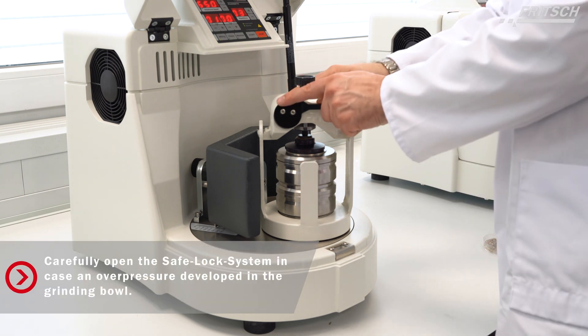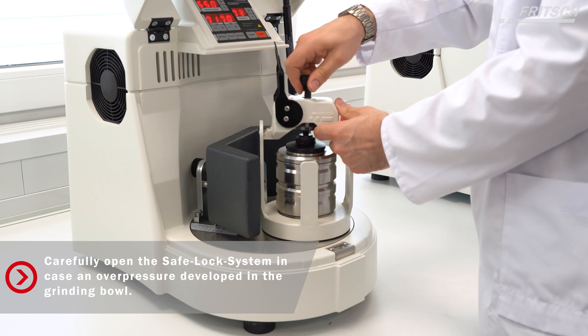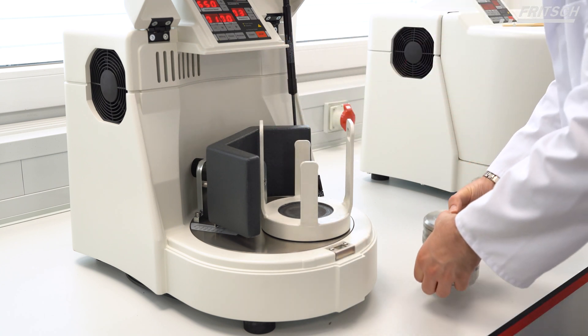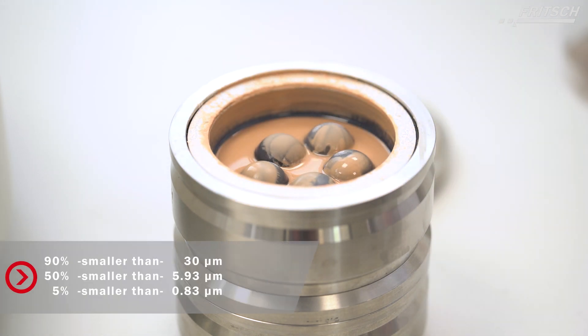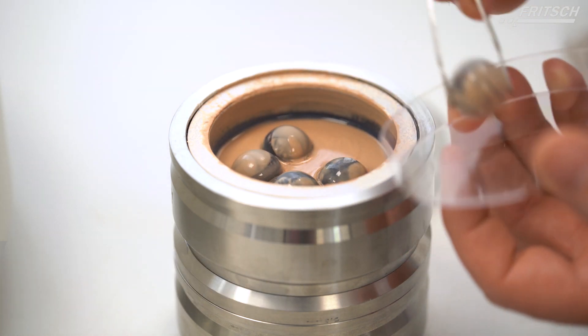Now carefully open the safe lock system in case an overpressure developed in the grinding bowl. We measure the particle size of the sample with the Fritsch Analysette 22, and now we know that 90 percent of the sample volume is smaller than 30 microns.